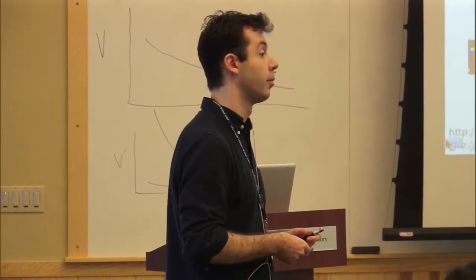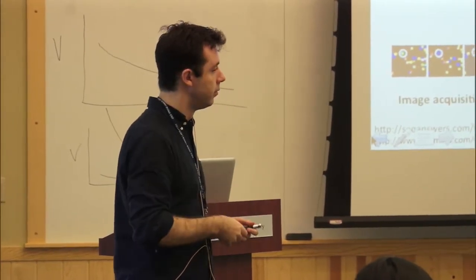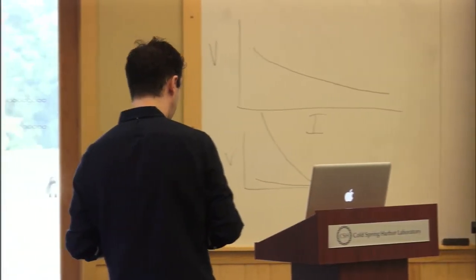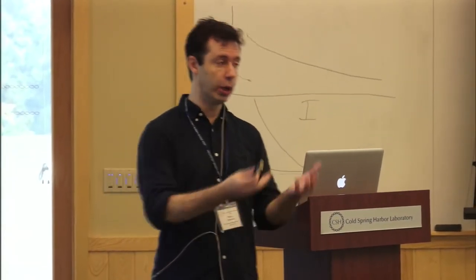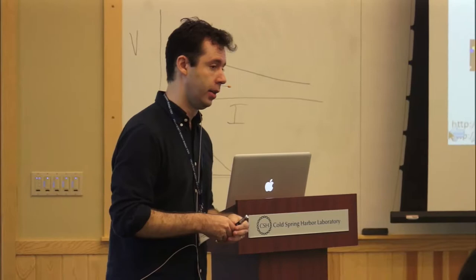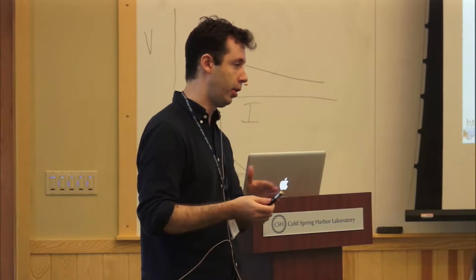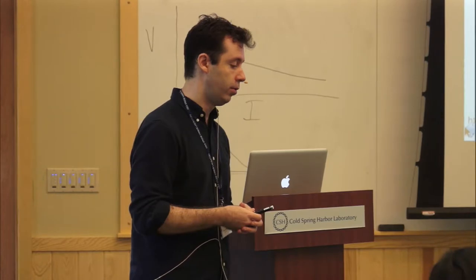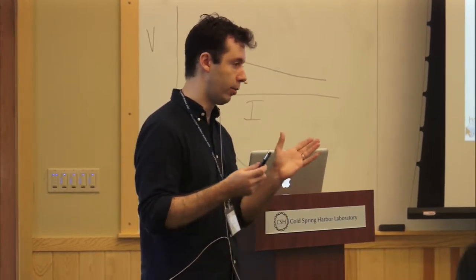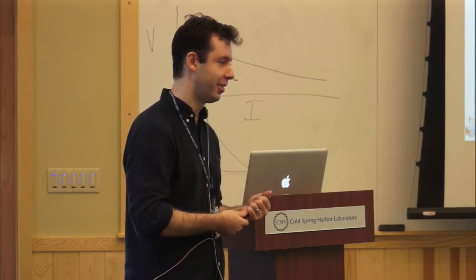So how do I know whether I need paired-end or single-end sequencing? Right, so this is completely part of the design of your experiment, and it's part of what you want to get out of the experiment. Depending on what you want to achieve, you would do paired end or single end. For example, if you want to detect novel isoforms using RNA-seq, what do you need to do? Does anybody know what he needs to do?